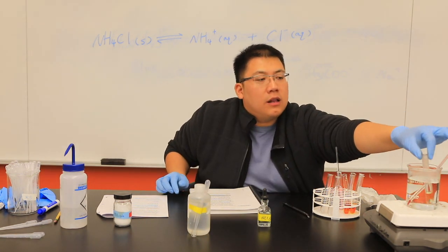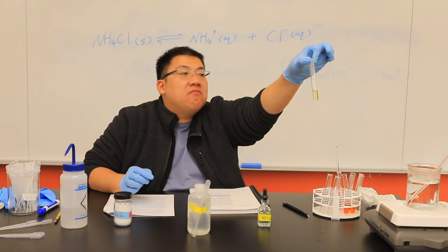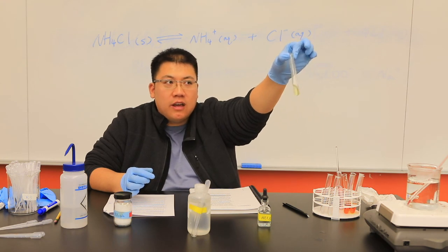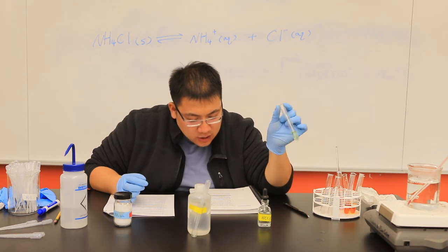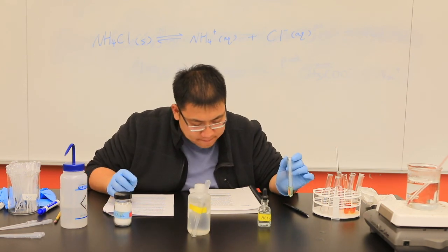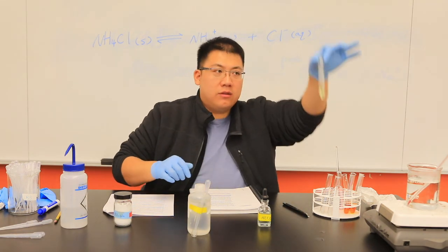So let's take a look at what's going on here. Where is the precipitate? This precipitate dissolved, right? So you have nothing, just a clear solution. Please record these observations in number 26 of your data sheet. And then moving on. So this one's done.